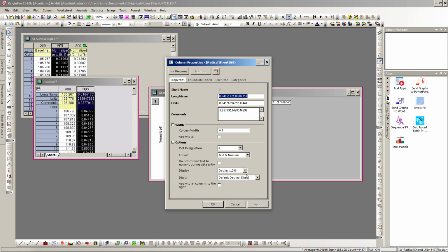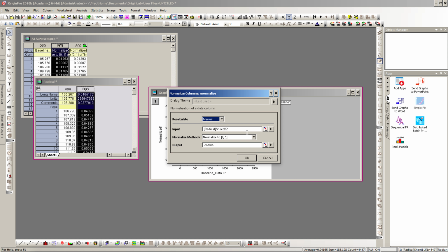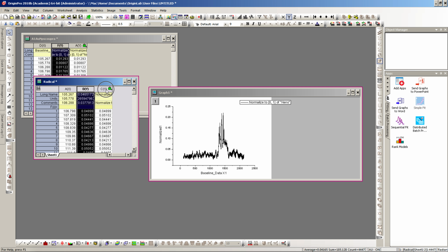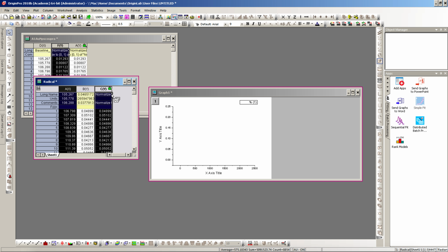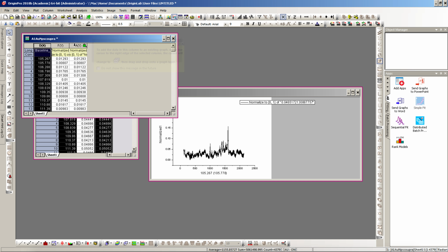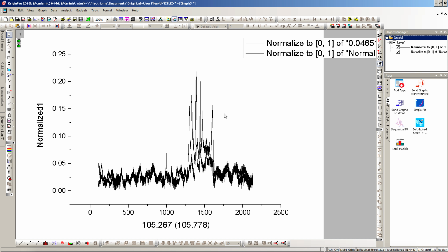So I will do the same here. Normalize. Then I have these two. This I don't care about anymore, so I'll just remove it. And then I have this one as control, and this is with the radical, and this is the couple. Now I normalize it. I made Control R, so it's normalized. It's more or less good. It's not completely finished, the actual finished product.